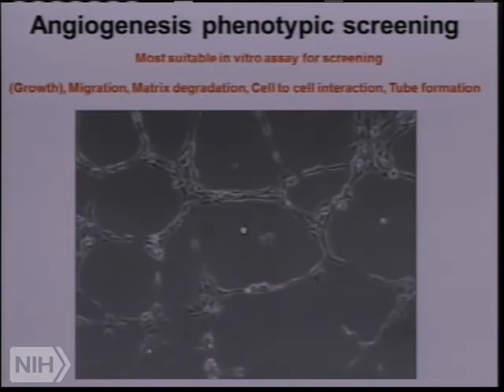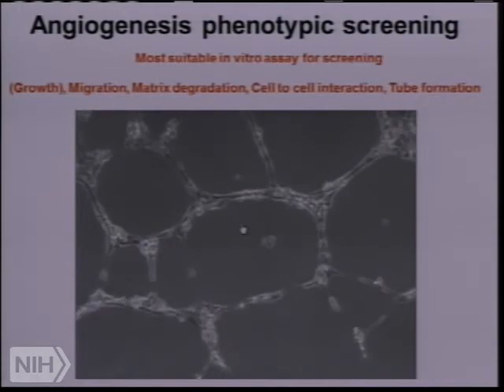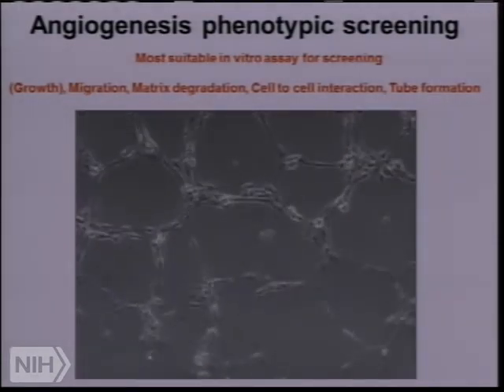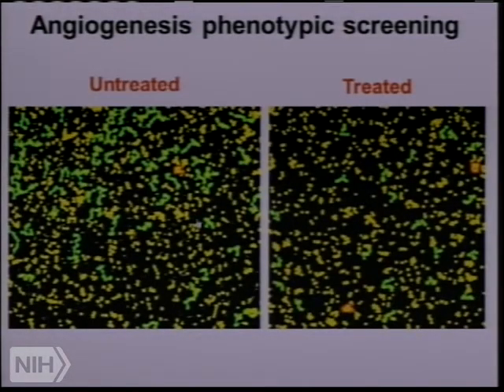Okay, there you go. The cells, which initially are homogeneously distributed in the matrix, will rearrange to form those cords that you see in there that mimic the vasculature in the tumor microenvironment. So this is what is called a tube formation assay. We didn't invent it; it's been around for a long time. But I thought that we could use this assay to do screens of drugs. To make a long story short, this is just an example of some of those screens that we did.